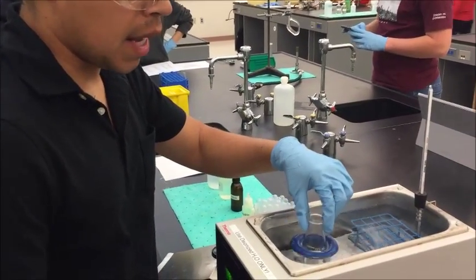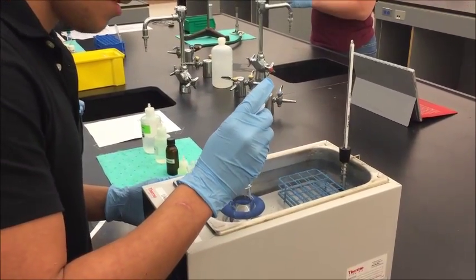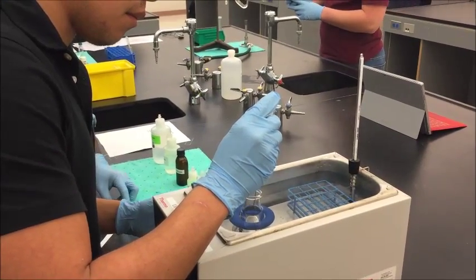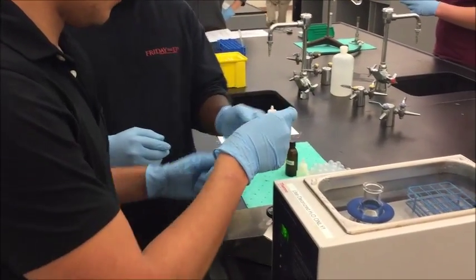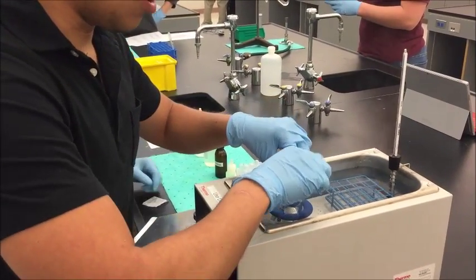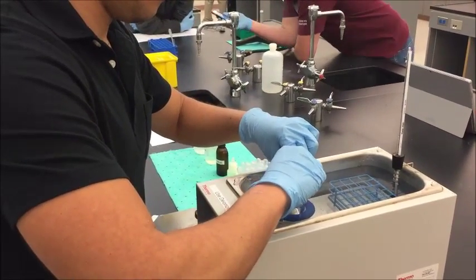Once the solid is dissolved, we add 0.8 ml of iodoethane. Then we cover with parafilm and leave it in the water bath for 10 minutes. Don't forget to swirl every couple of minutes.